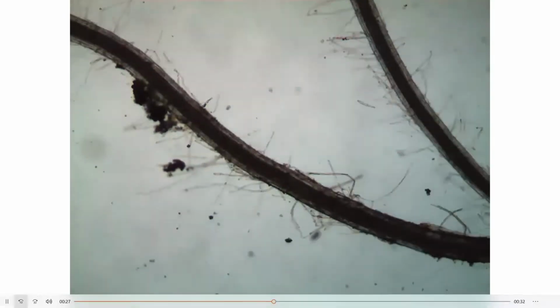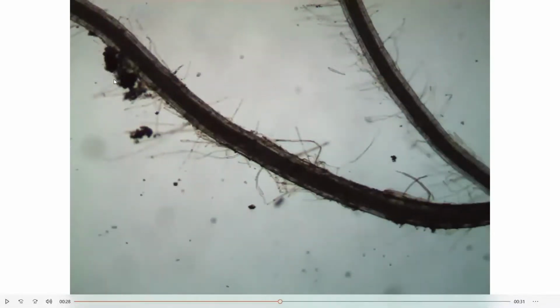Oh, pause this for a second. And that's because these root hairs only last so long, usually about 2 weeks, and then they essentially wither away and die, and that just forms the mature root. And the mature root, its epidermis is highly waxed so as to prevent any water that's being taken up from being lost. And you can see this other root over here.